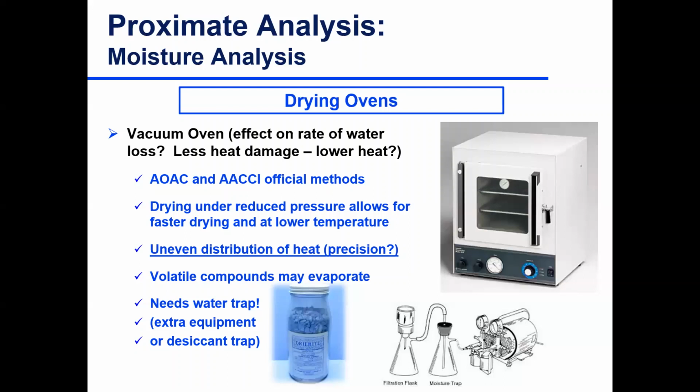If you put 4 different samples, or 4 of the same sample in the oven in different places, and you all get the same results, you feel pretty good about it. Okay, good. I didn't have a problem with the oven. It's going to work. It's going to give me the data.